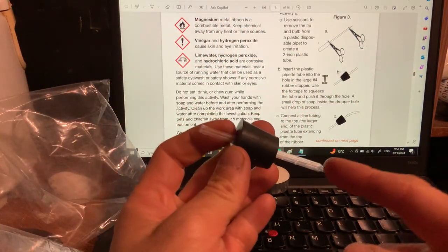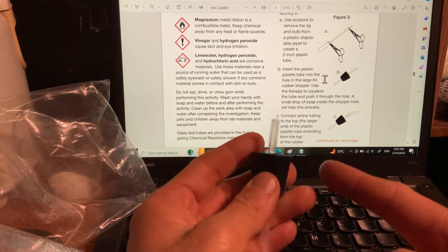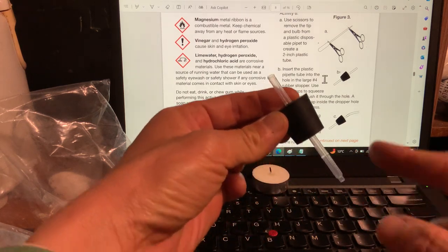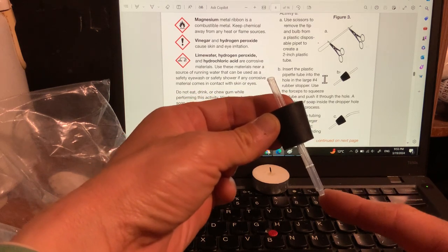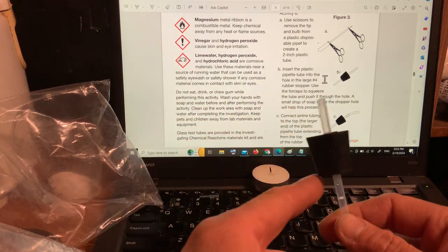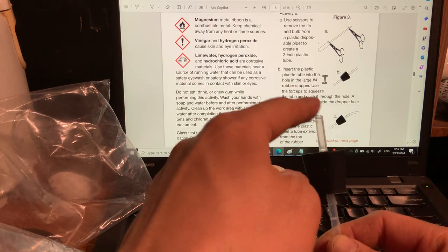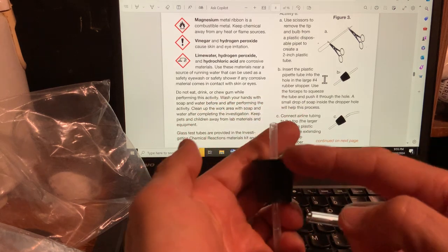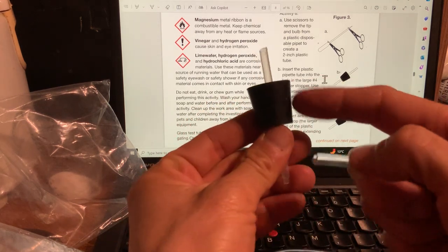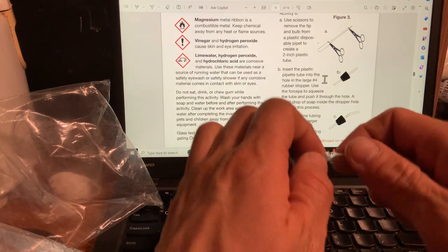Okay. Now I have the narrow side in. I have the fatter side out. You see that? This pipette has a narrow side in, going in the same direction as the narrow side of the stopper. The fatter side, same direction as the fatter side of the stopper. On the fatter side, I'm going to put the tube. Put this tube on here.